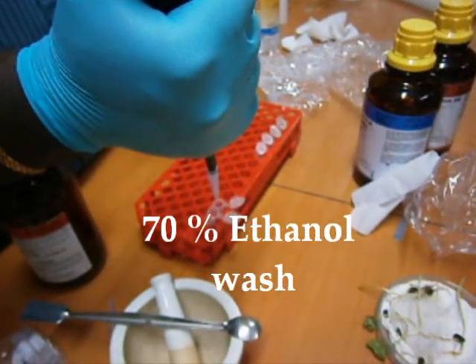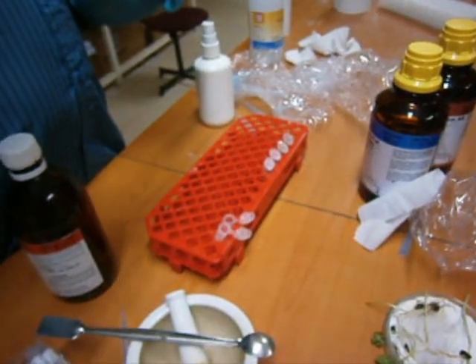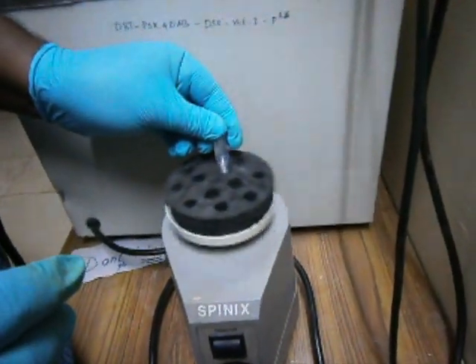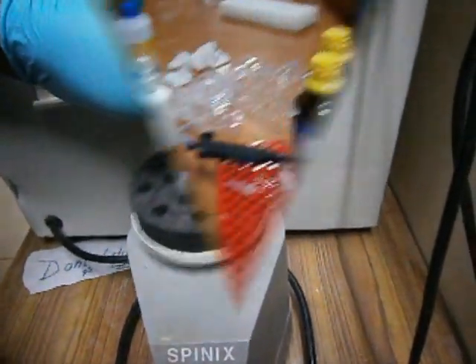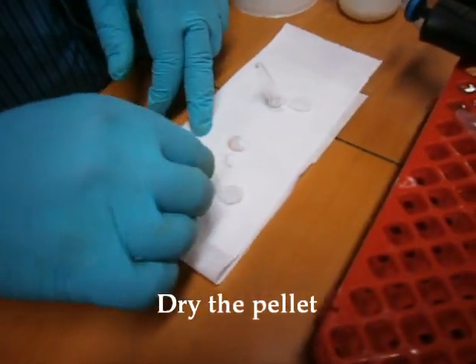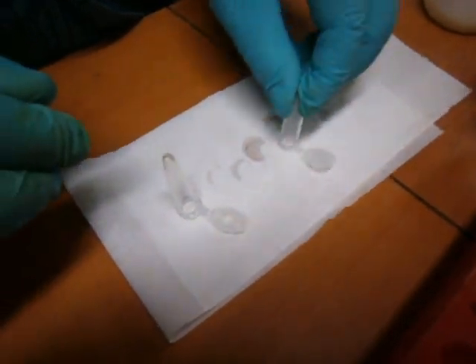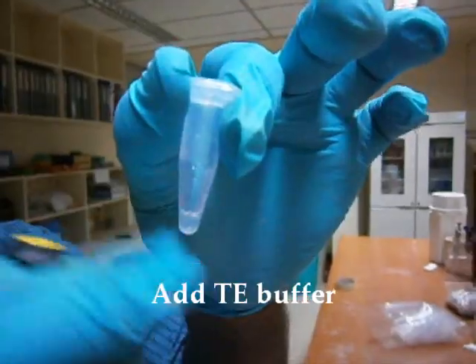70% ethanol was added to the pellet. The tube was vortexed and then centrifuged. The supernatant was discarded and the pellet was dried using a blotting paper. The pellet was dissolved in nuclease-free water and stored at minus 80 degrees Celsius for further use.